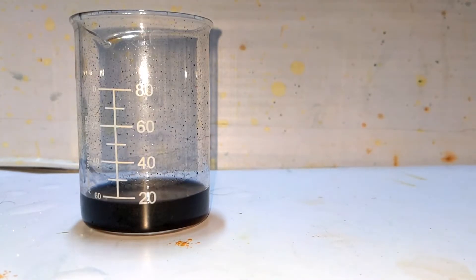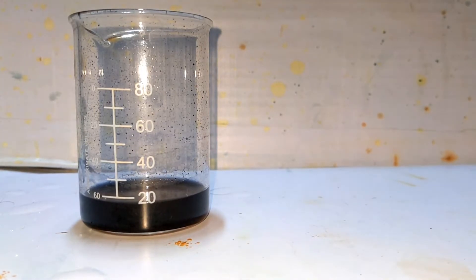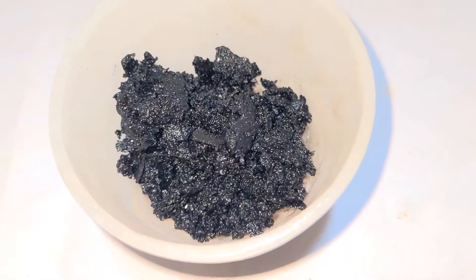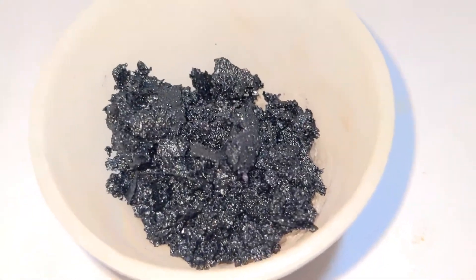Upon cooling, the crystals of potassium trisoxalatochromate(III) separate out as deep green to almost black colored shining crystals.